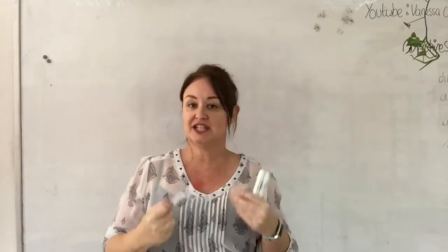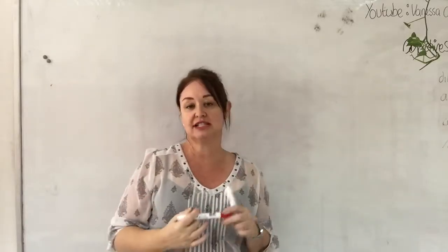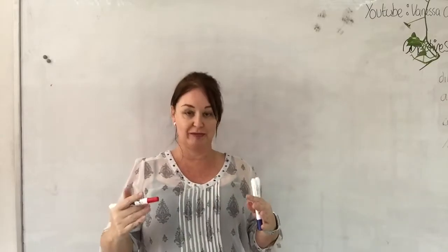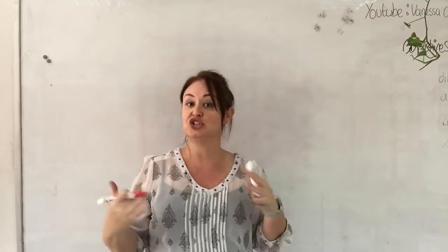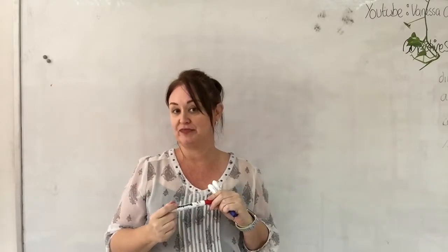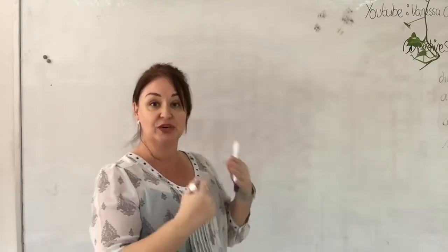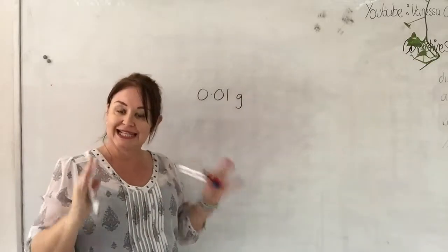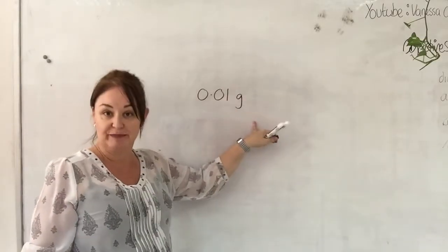The uncertainty of the digital balance is slightly different, and that's because the digital balance takes a reading and not a measurement. What do we mean by that? Well, with a reading, we can rest assured that 0 doesn't need any judgment from us because 0 has been calibrated by the manufacturer. So when I measure the mass of the potato, all I'm measuring it to is the nearest resolution. And in this case, the resolution was to 0.01 of a gram.